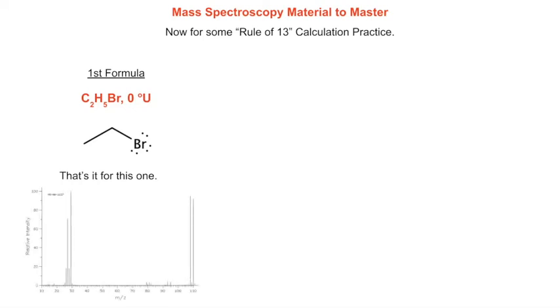And I look up the mass spectrum, and here it is. And look at that, isn't that great? Our most abundant isotope, bromine 79 and carbon 12s and hydrogen 1s, this molecular ion, and then here's an isotope peak. It's the molecular ion plus 2 because it's 79 to 81. There's about 51% bromine 79 and that causes the slightly taller peak at 108.